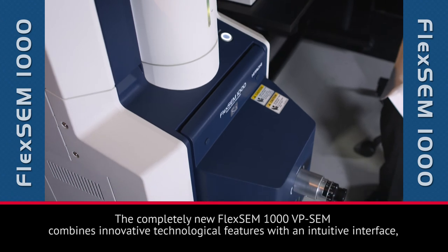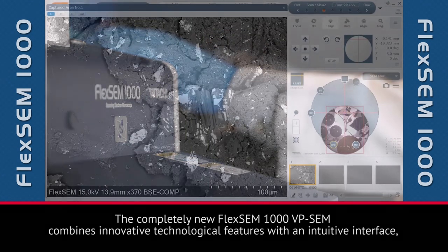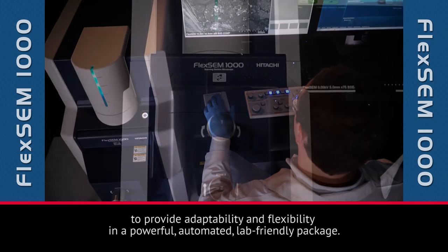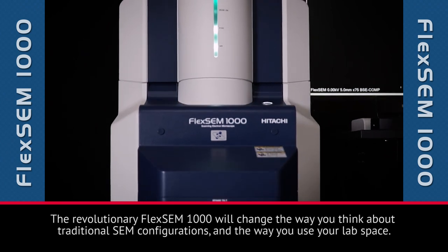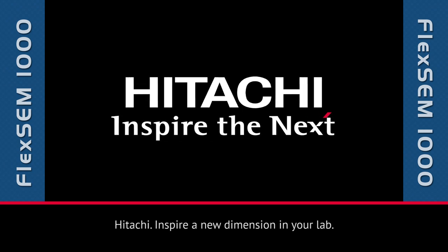The completely new FlexSEM 1000 VP-SEM combines innovative technological features with an intuitive interface to provide adaptability and flexibility in a powerful, automated, lab-friendly package. The revolutionary FlexSEM 1000 will change the way you think about traditional SEM configurations and the way you use your lab space. Think outside the lab. Hitachi — Inspire a new dimension in your lab.